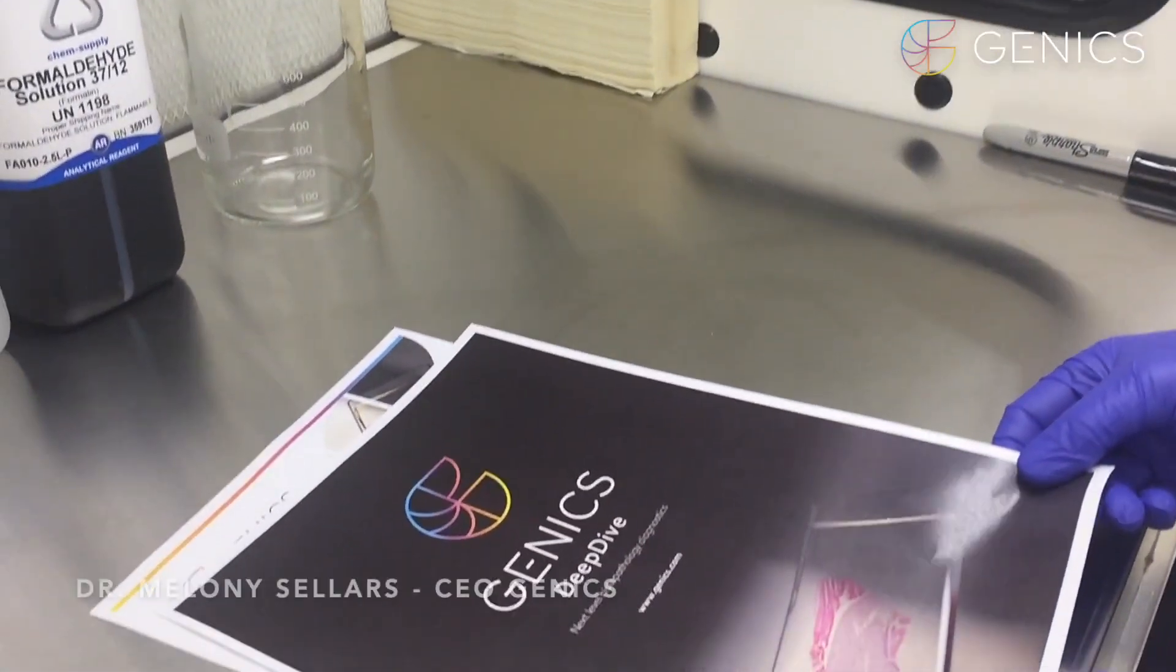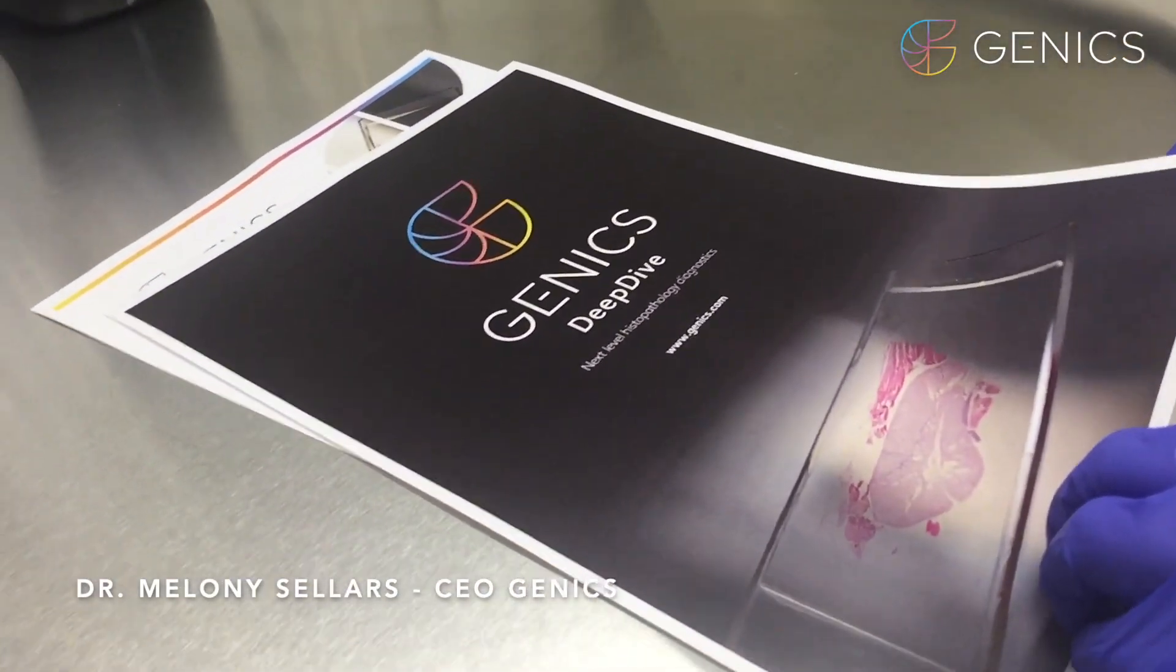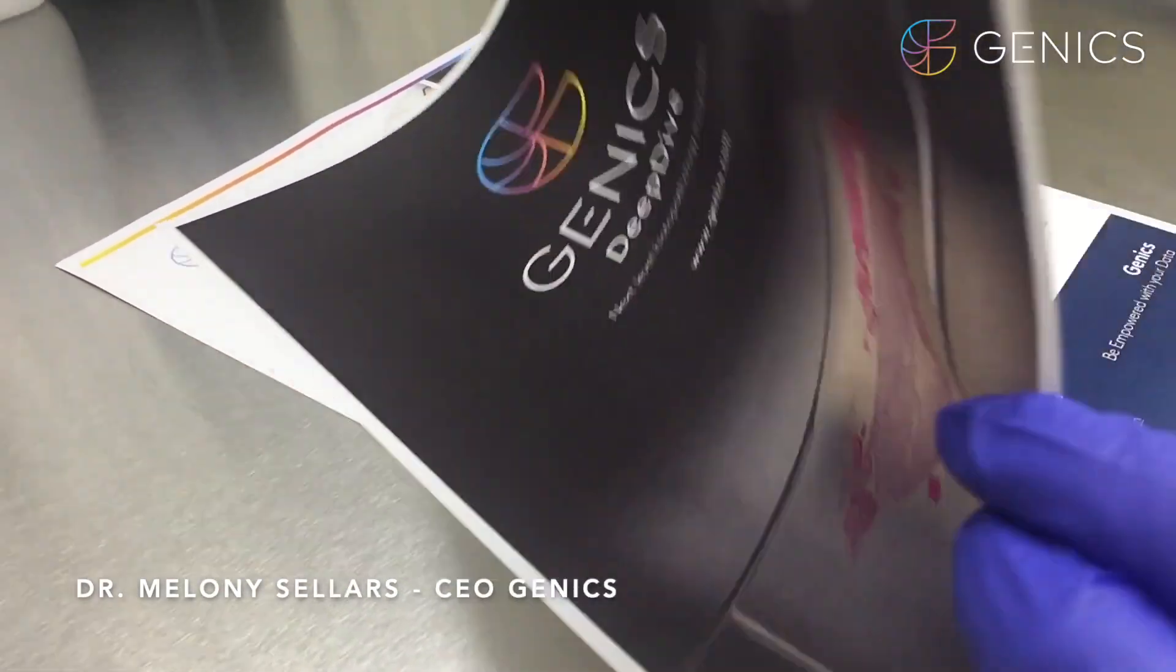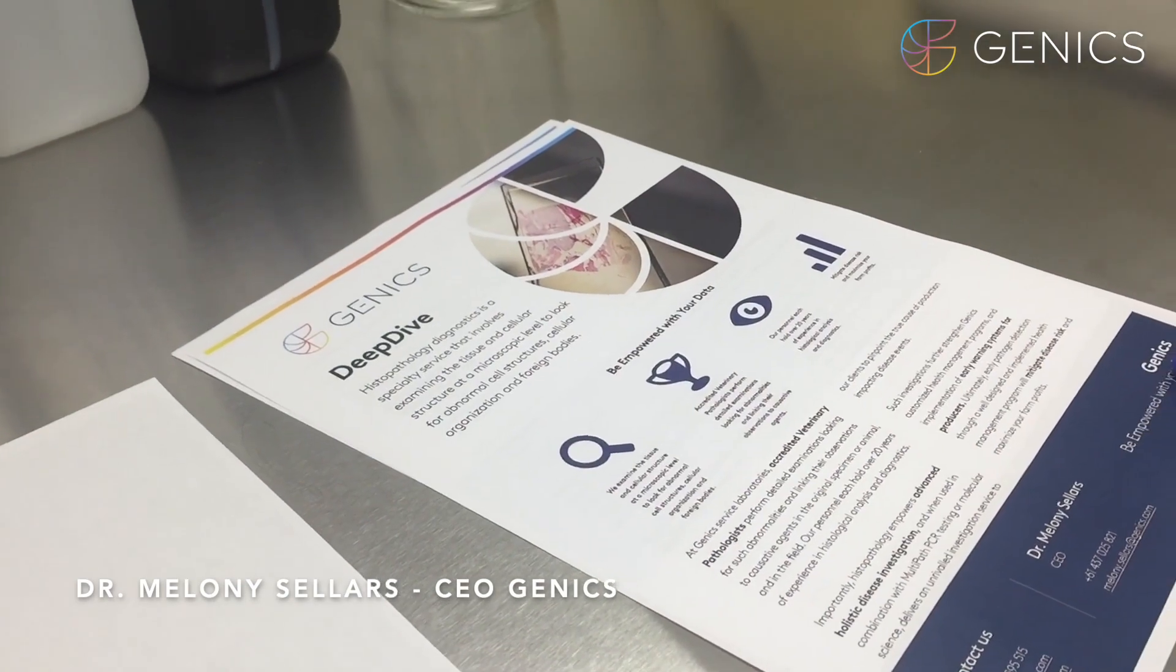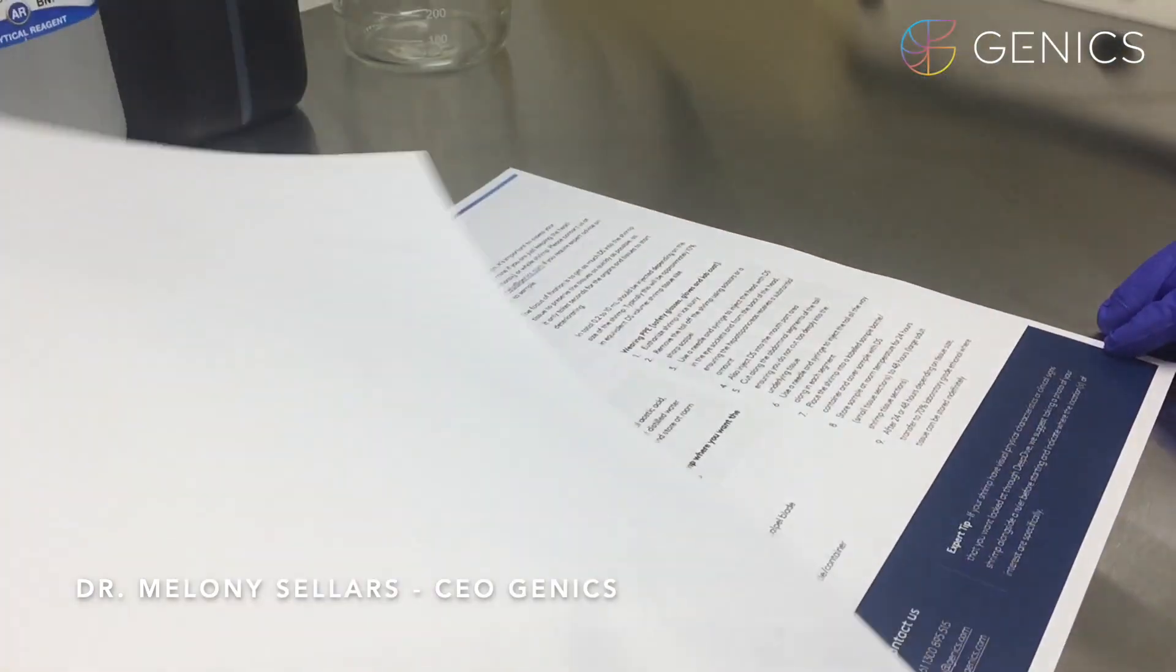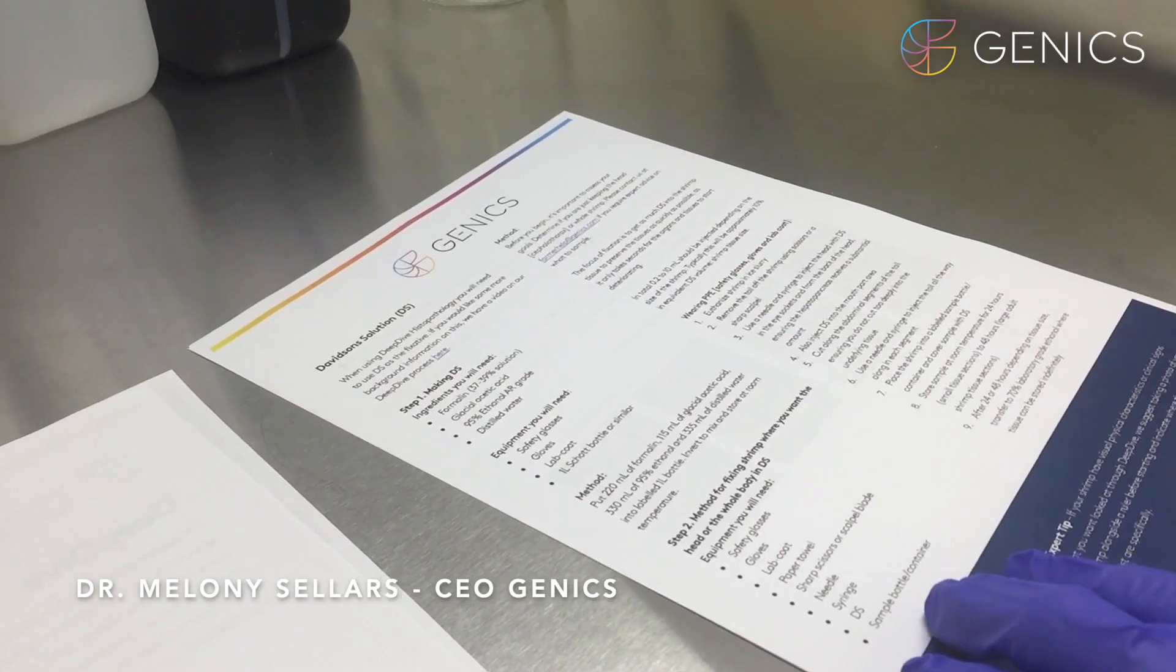Today we're going to make some Davidson solution for deep dive. Davidson solution is used as a fixative to fix the shrimp tissues for later histopathology.